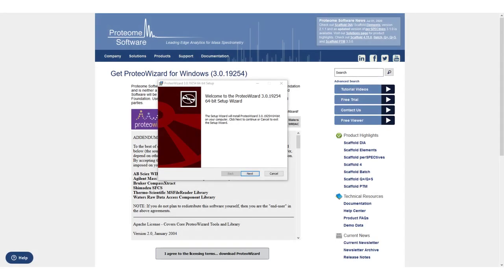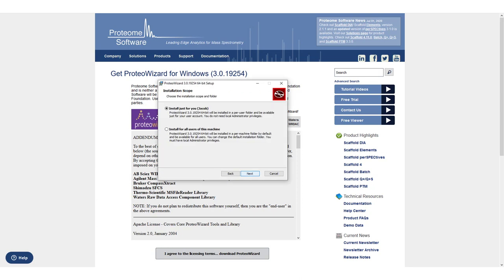Click Next to work your way through the ProteoWizard installer. Select the option to install for all users of this machine.